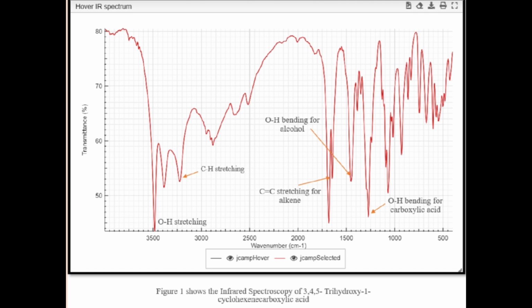figure 1. Based on the structure, it shows that the broad OH stretching frequency is due to intermolecular H bonding, but in gas it shows a sharp peak for OH stretching due to the absence of intermolecular hydrogen bonding. The sharp peak, which is the infrared peak of 3,500 cm⁻¹ wave number for OH stretching, is at the first peak in the figure 1. So that's all from me.